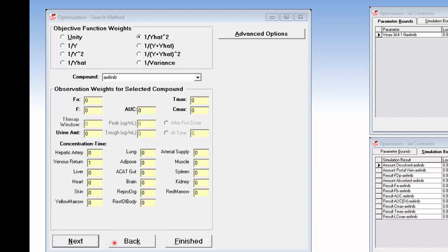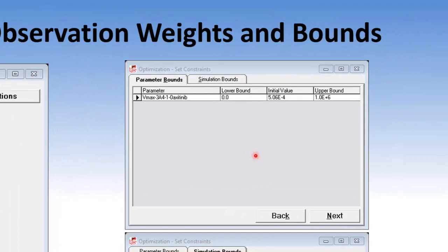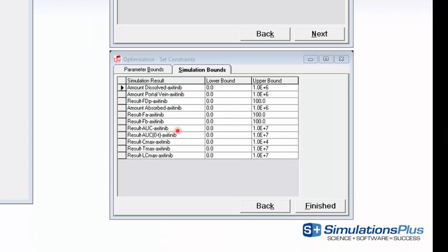Clicking next will display the dialog box where you can set the lower and upper bounds for the parameter to be optimized. Then clicking next again shows the simulation bounds, which are used to keep values in reasonable ranges during the optimization.